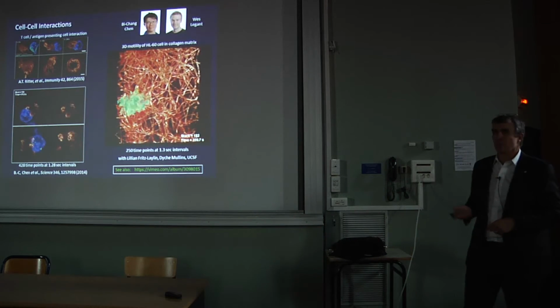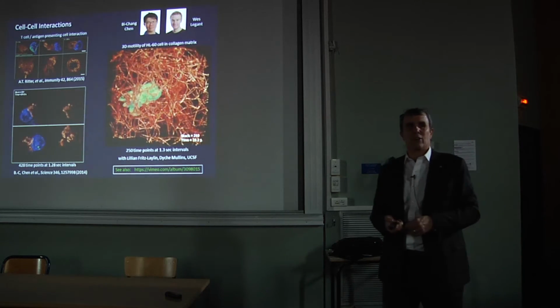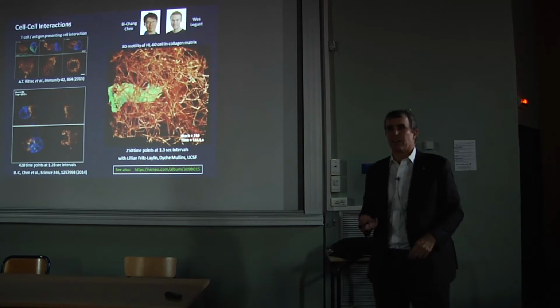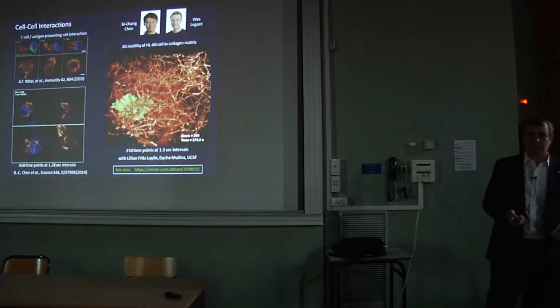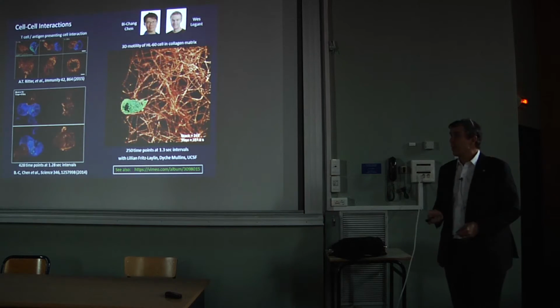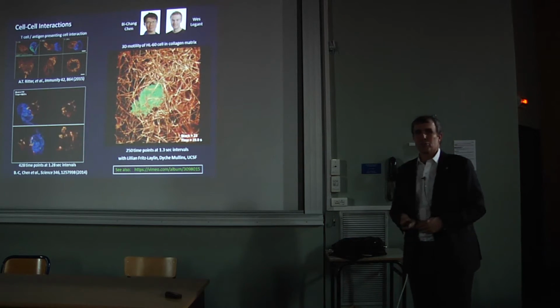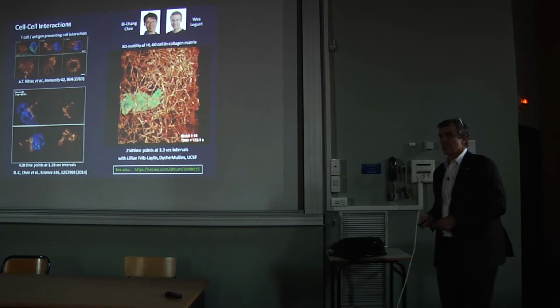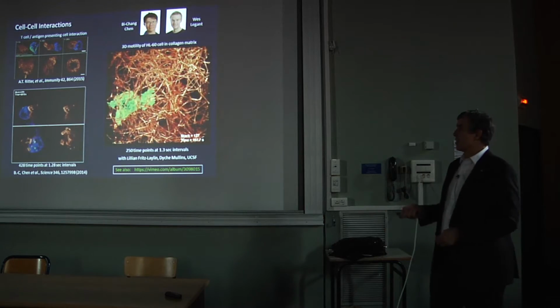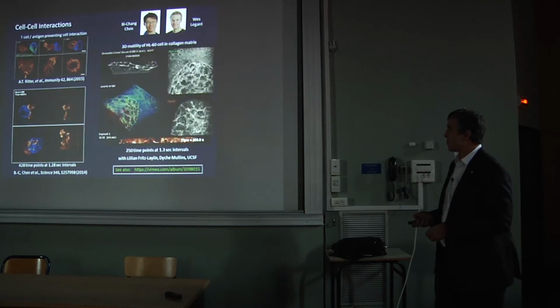Now in this case, what you're looking at is 3D motility. Much of what we know about cell motility is looking at cells crawling on cover slips. But if you want to understand cancer metastasis, for example, that's a pretty poor model. So this is looking now in a collagen mesh at a neutrophil-like cell moving in 3D. And so with this, we can finally see the cells in the sort of form they really are as they try to move through tumors.